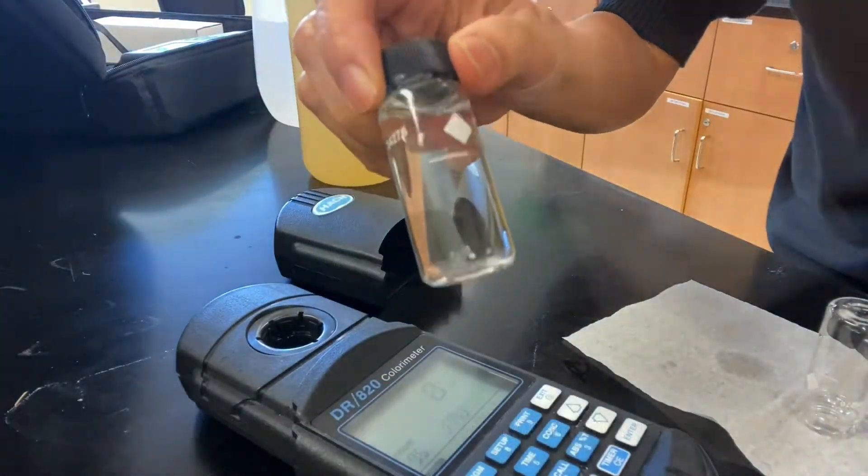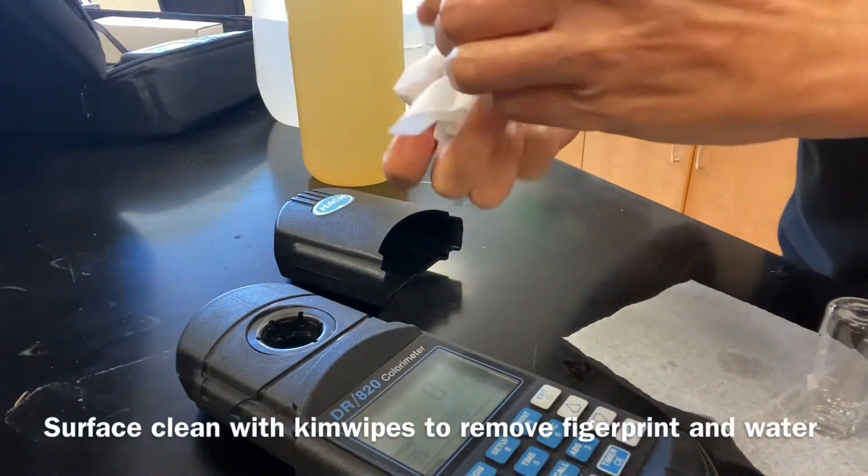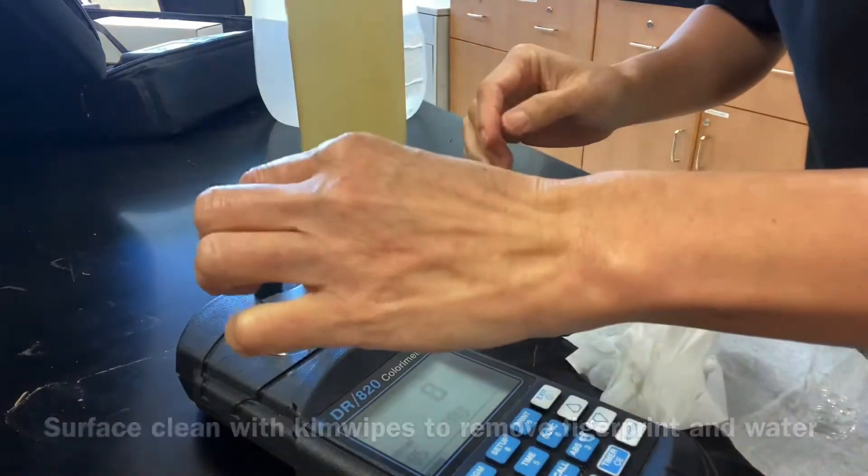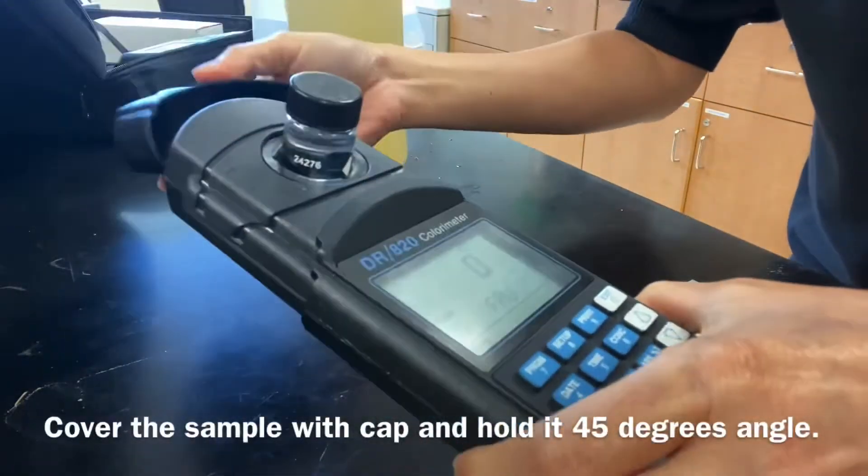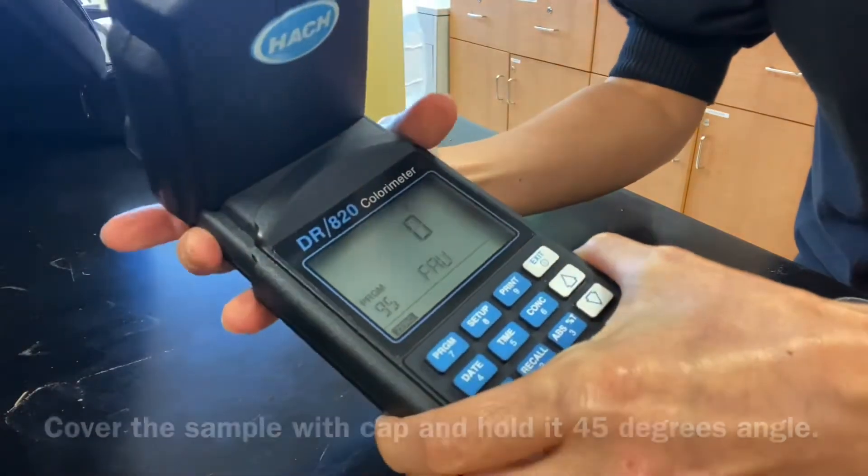The most common one is NTU, Nephelometric Turbidity Units, or FAU, Formazine Attenuation Units. Basically, 1 NTU equals 1 FAU.